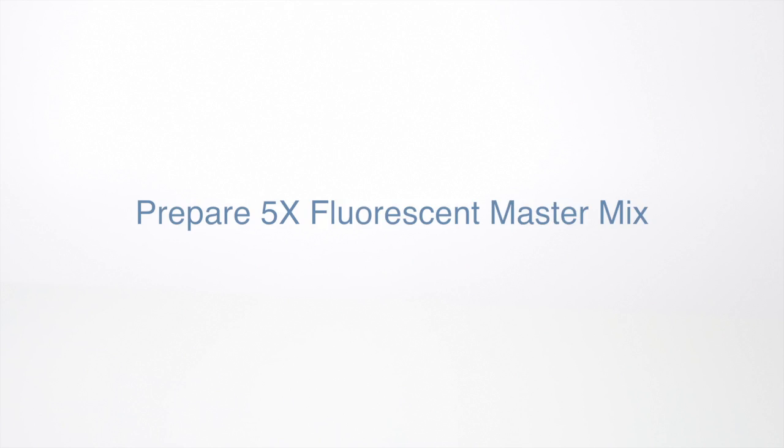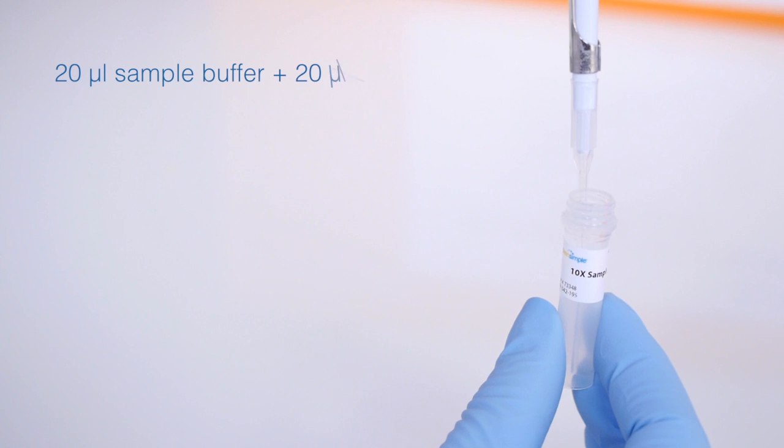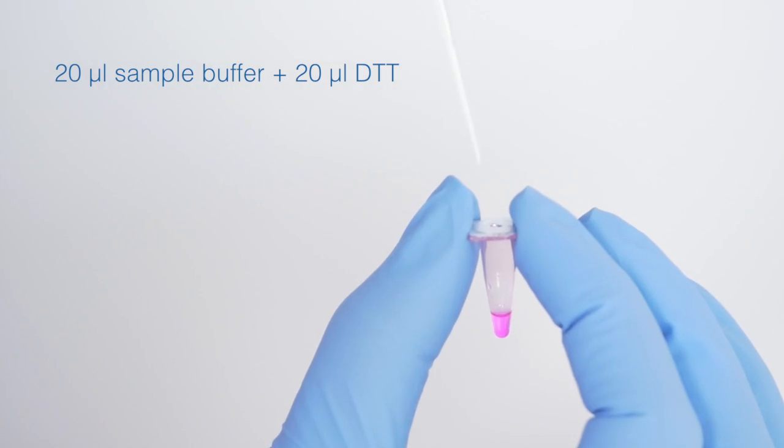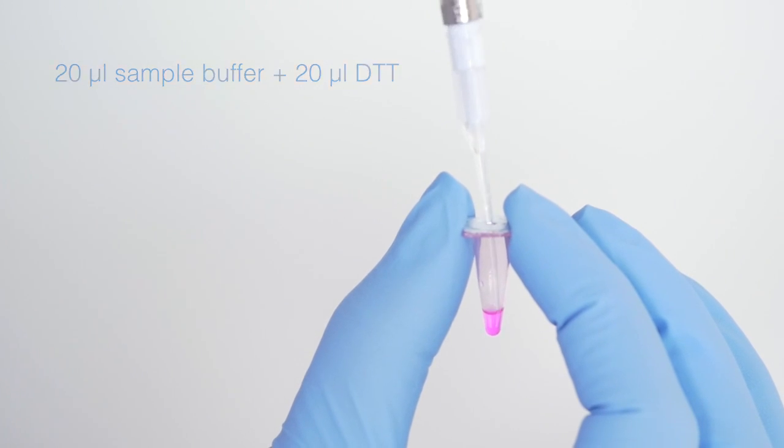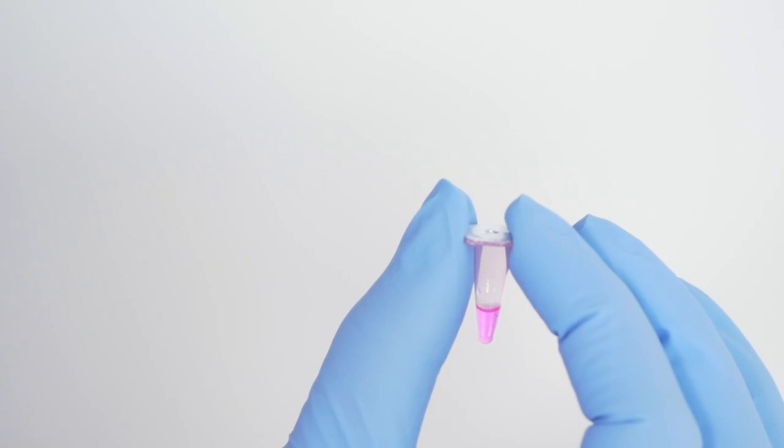Next, we'll prepare the 5X Fluorescent Master Mix. Pipette 20 microliters of the 10X sample buffer into the pink tube and add 20 microliters of the DTT solution you just prepared. Gently mix by pipetting up and down a few times. Now you've got your Fluorescent Master Mix.